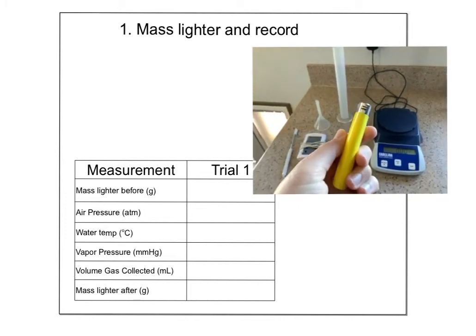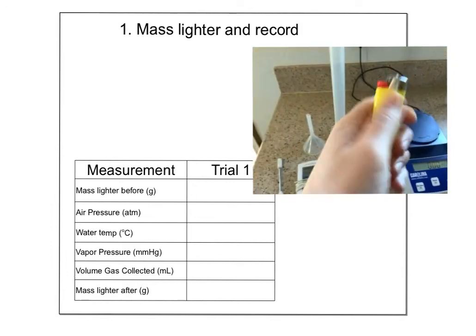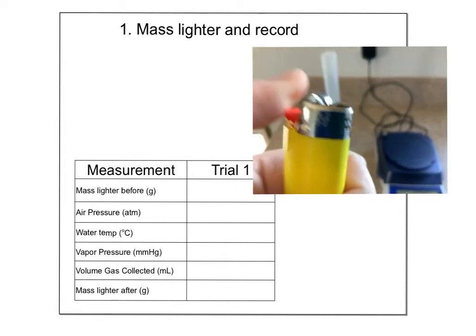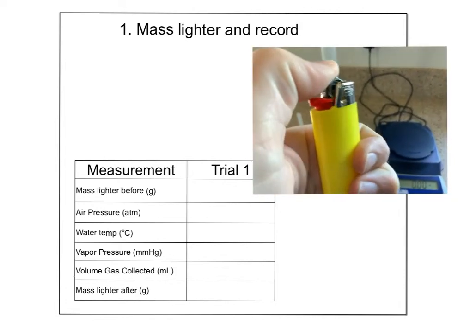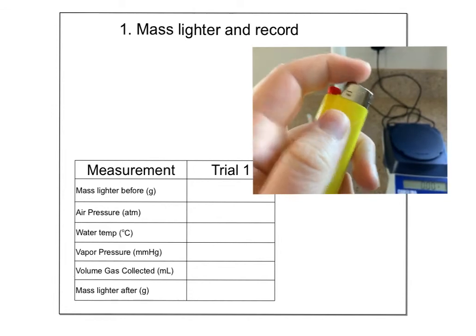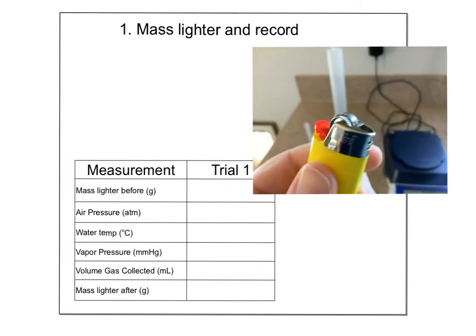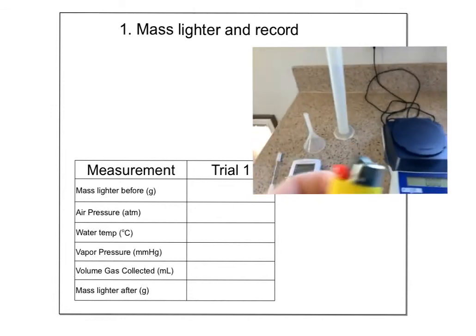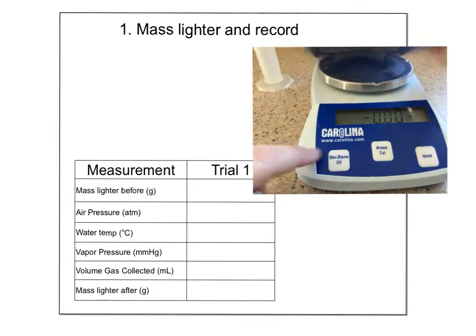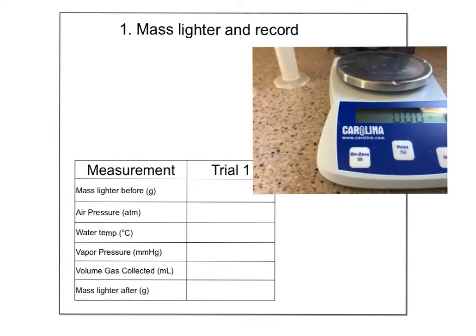I went to the store and got a lighter that we're actually going to use. The red button releases the gas — I'm just going to push that, not the striker, since I definitely don't want an underwater flame. Step one: zero the balance and get the starting mass of the lighter. The lighter before: 21.49 grams.